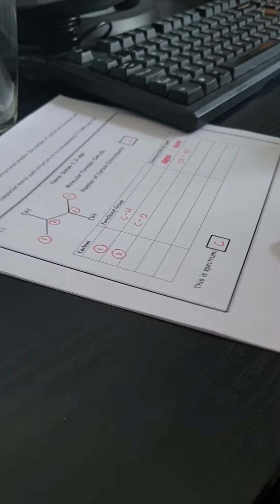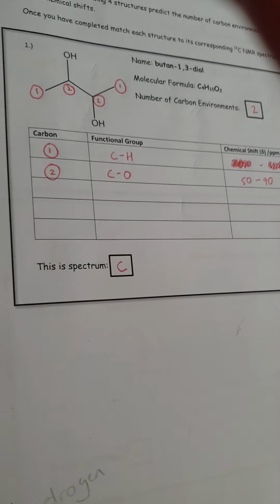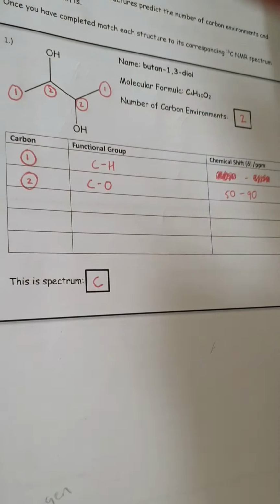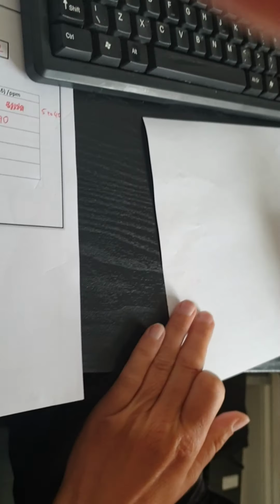Now I'm going to work through an example, and I'm going to concentrate first of all on carbon NMR. So this was 2 days ago's lesson. Don't worry if you haven't quite finished it, just as long as you're doing your work. And then I'll do a hydrogen NMR example as well. So I'm just going to stick with this first one here, and hopefully this will make life easier for you to understand. Like I say, it's hard teaching this stuff from a distance, but let's just try our best, that's all. So we've got this molecule here.